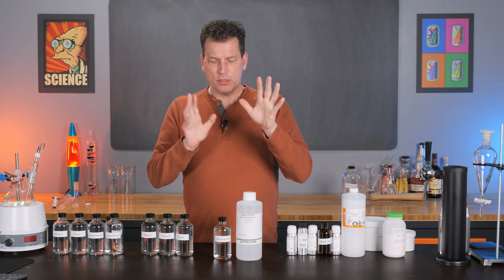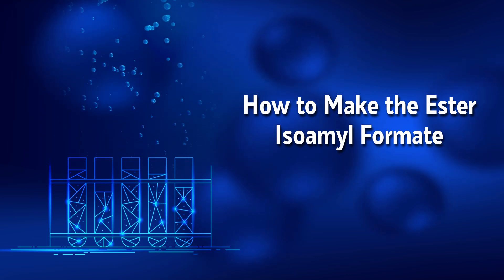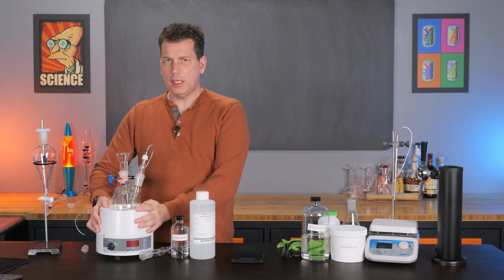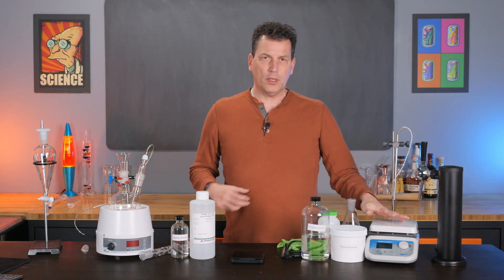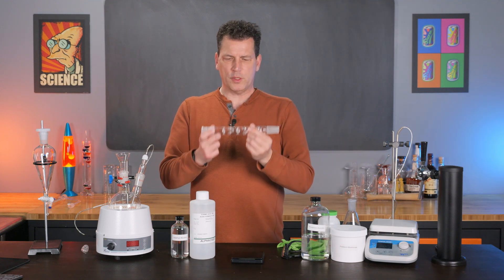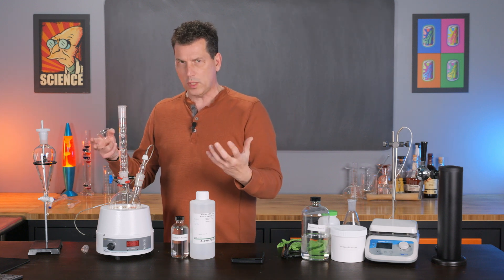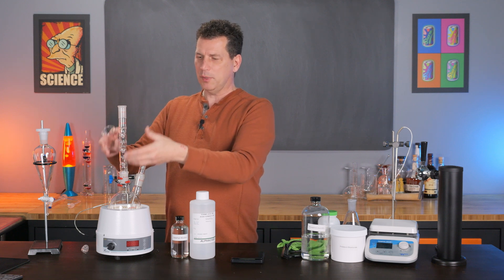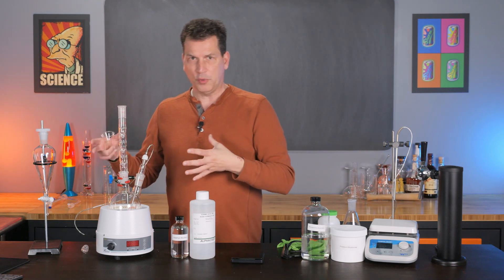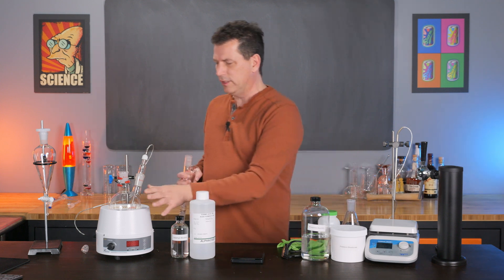That's about it for the quick review on esters, so let me show you how to make some isoamyl formate. Making this ester is simple — you don't need a lot of equipment. I'm going to do it in this heating mantle, though you could do it on a hot plate with a stirrer and a flat flask. For safety, I like to put a reflux condenser in there — it's passive, so you don't need any cooling or water source. It'll just help condense any vapors that happen to get above the top of the flask, and it keeps the system open to the atmosphere so no pressurized glass.